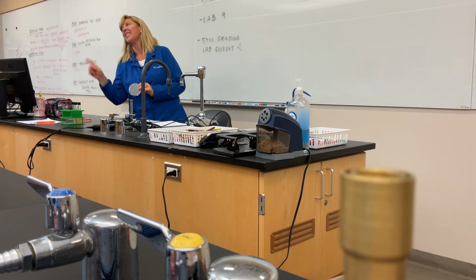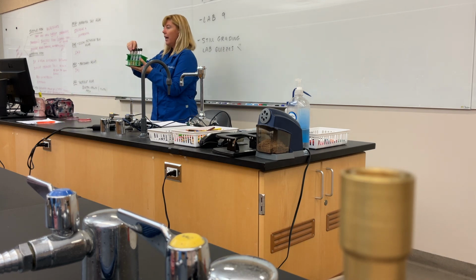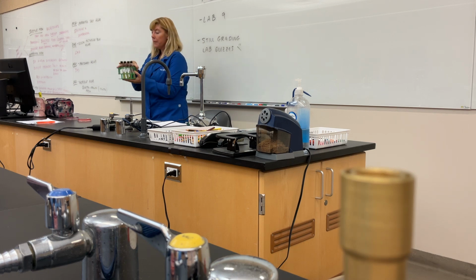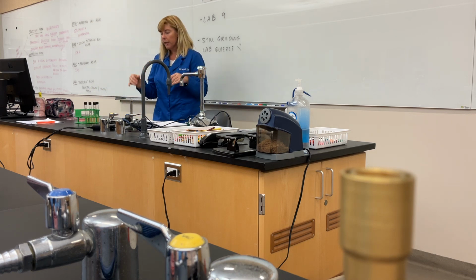coli, I'm really staph. They did the wrong one. So what that means is you want to work slowly, and you really want to look at what the tube labels are before you set anything up.